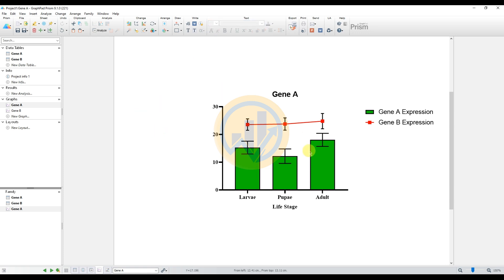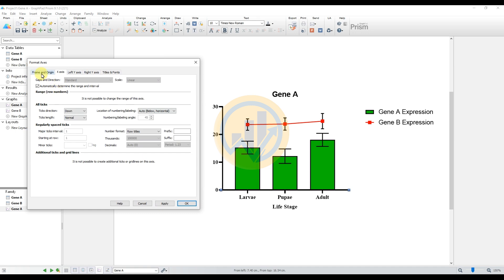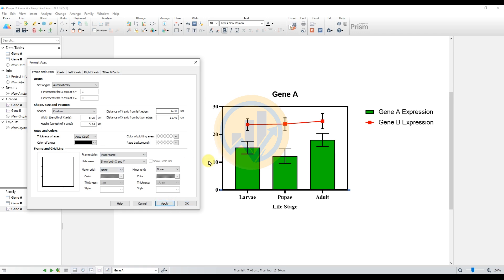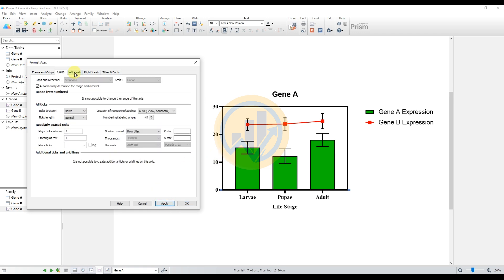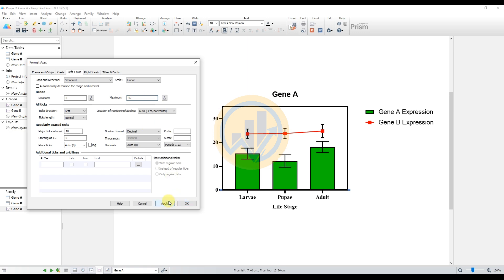Double-click on the x-axis bar to open the Format Axis tab. Go to Frame and Origin options and select the frame style as 'Plane Frame,' then click Apply. For the two y-axes, uncheck the automatic range interval, set the maximum value to 35, and click Apply.